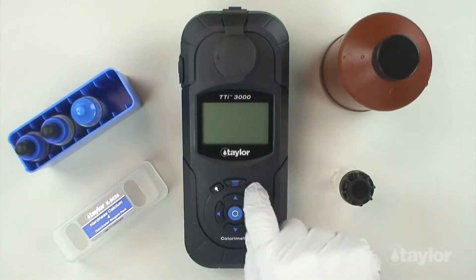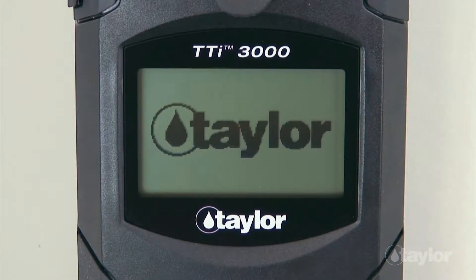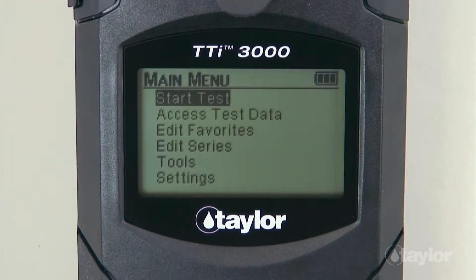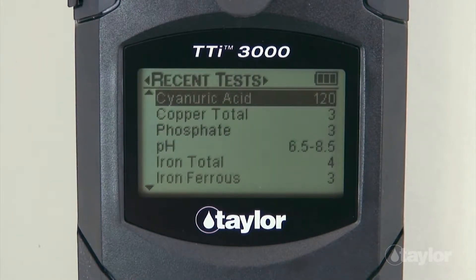To begin, press the power button to turn on the colorimeter. Press the main menu button and select a test menu: all tests, recent tests, or favorites.